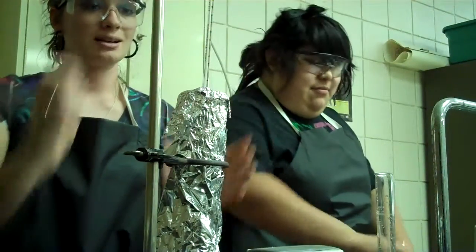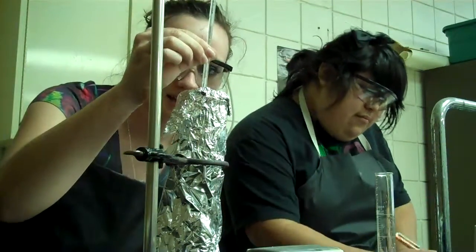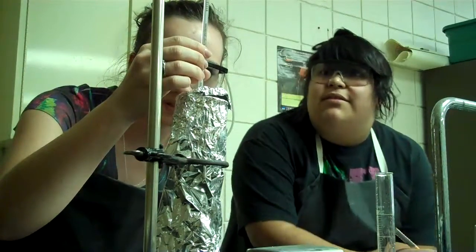Make sure you record the initial temperature of the water. It is 23 degrees.